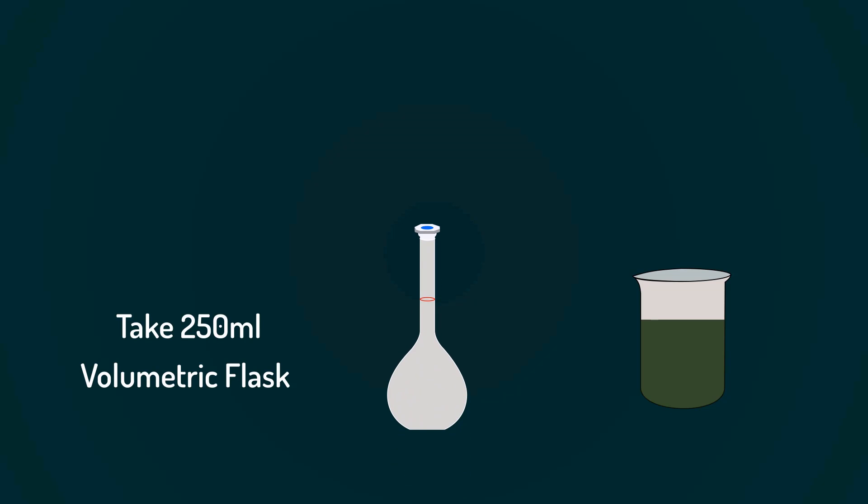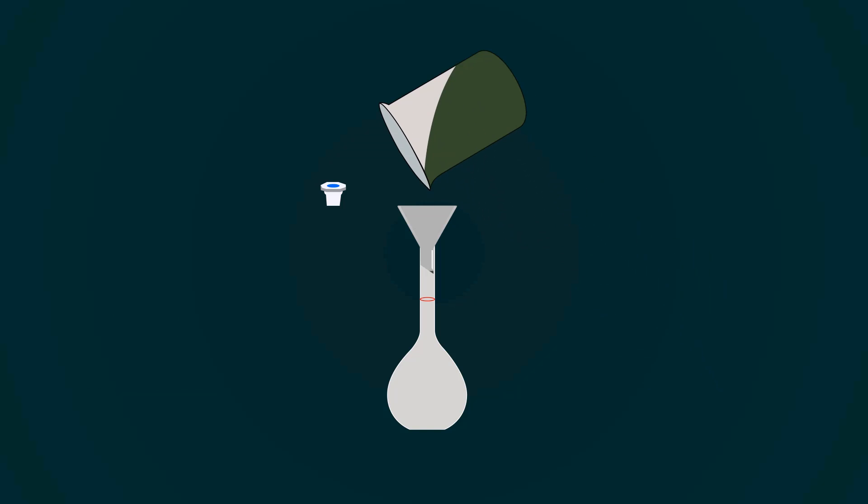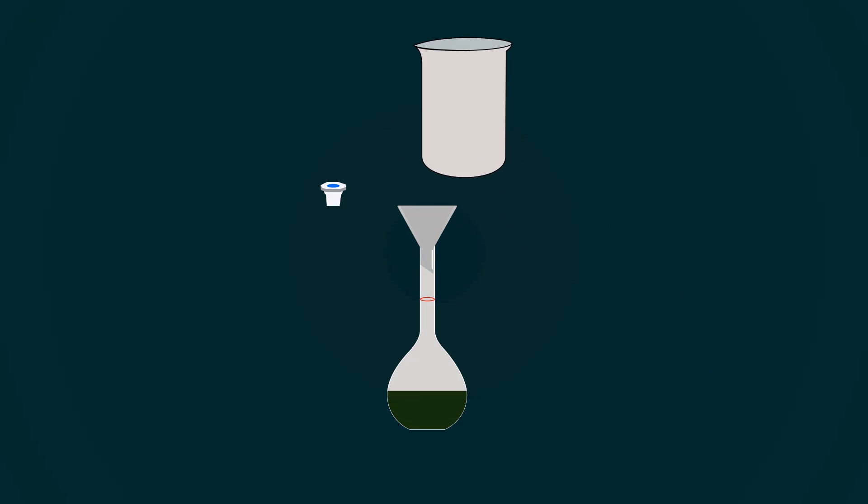Take a 250 milliliters volumetric flask. Now, pour all the solution into the volumetric flask with the help of the funnel.